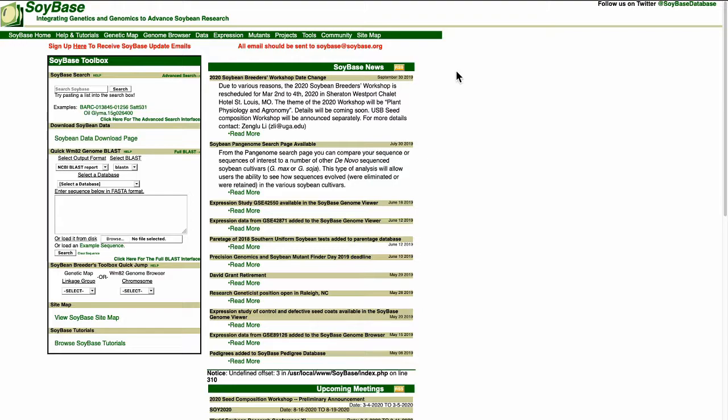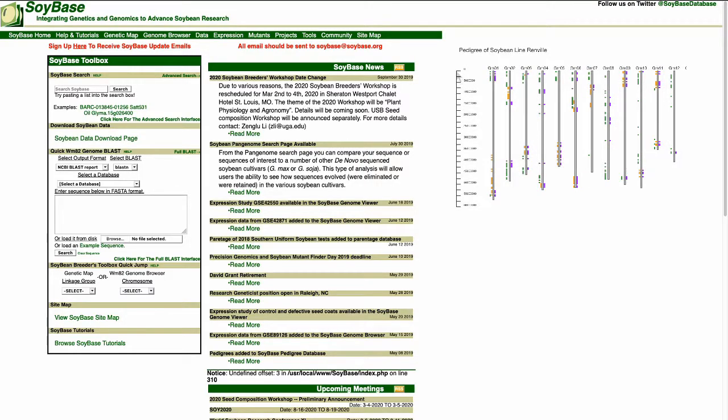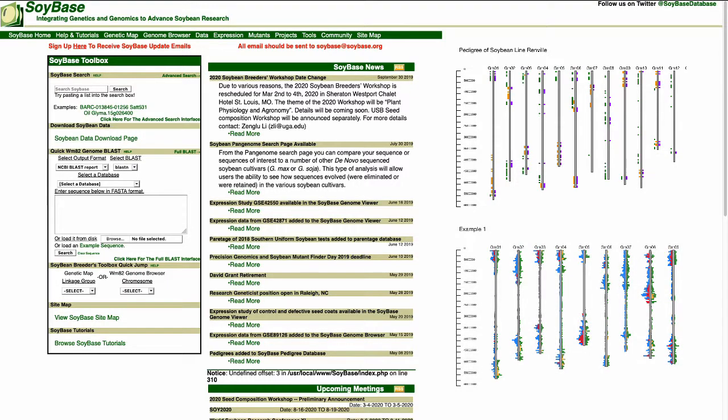GCivit will then plot these differences on the chromosomes so a user can visualize where these differences lie. One use case would be to plot the differences between a progeny and its parents. That way a user can identify which regions were inherited from which parent. Another use case could be that multiple lines are very similar but have different phenotypes. GCivit can plot all these lines and then a user can identify where exactly these differences lie that can attribute to the phenotypic differences.